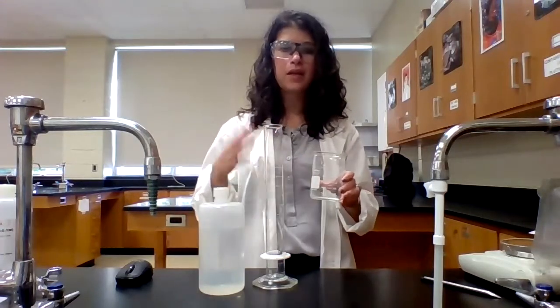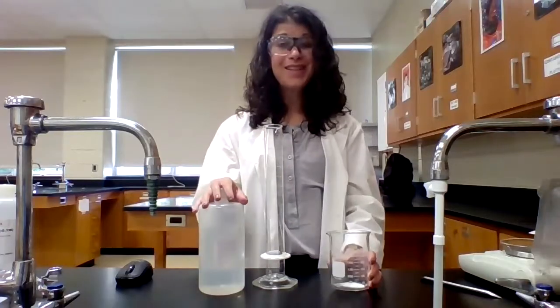All right, so now that I have my unknown carbonate heated and dried to a consistent mass, now I actually need to add water to it. So I'm gonna add water to this for when I react it with the calcium chloride. I need to measure out about 200 milliliters of water.